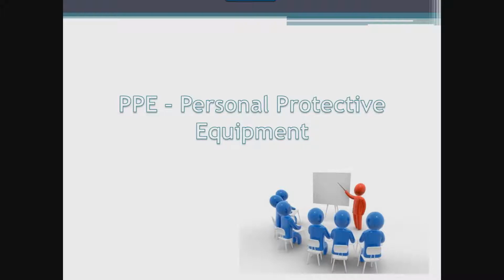Employees must wear the appropriate personal protective equipment when handling hazardous chemicals in order to protect themselves. Staff often cut corners here because they are in a rush or they might not feel it is convenient to don the appropriate PPE, but it is so important for them to do so, and it is important for leaders to hold staff accountable to this. It is for their safety and the safety of everyone in the laboratory.